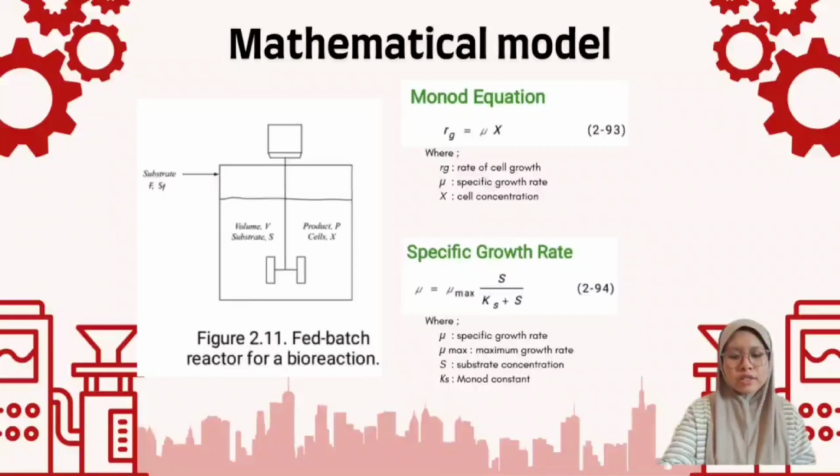So for this slide, I want to present the equations above for the fed batch bioreactor. As you can see in the diagram, it is a tank where we continuously feed a substrate but cannot remove the product or cells during the process, only at the end.